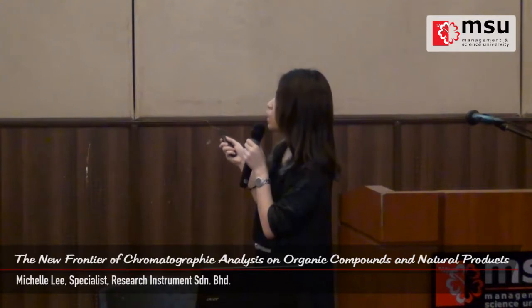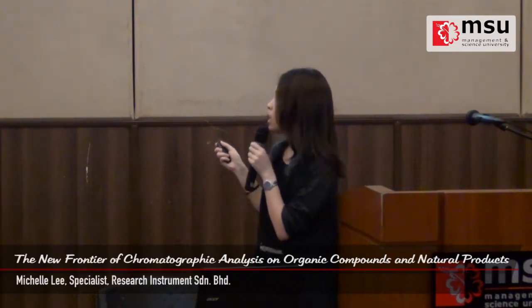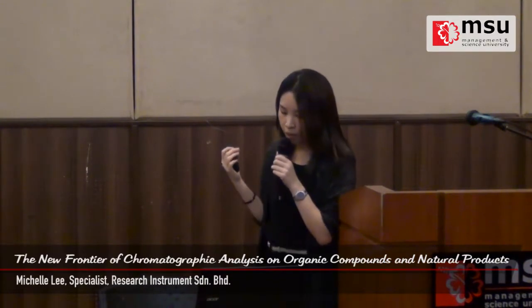So what's the difference to an HPTLC plate? The HP, as I mentioned, is high performance. We have this kind of plate, and we actually thank the plate manufacturers because they incorporate some technology to improve the plate performance. So the difference is generally in the particle size of the silica.